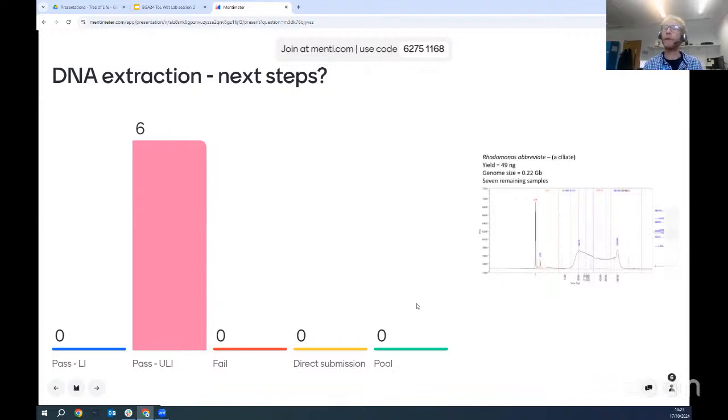I think if someone had said pool the DNA and do a second extraction, that would also potentially be a good option. During the fragmentation steps, we do lose some DNA, but generally not more than half the DNA will be lost during the fragmentation step. So we'd probably generally make it to that 20 nanogram minimum that is required for ultra low input.